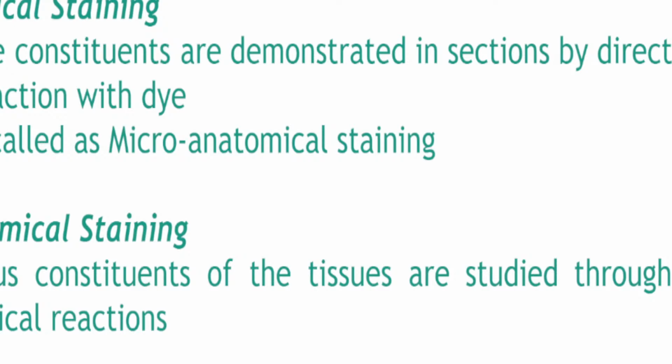Okay. All right. So staining is the first thing that comes to your mind when you talk about histology, right? Why? Because the first thing that you looked at in the microscope is a stained slide, 'di ba? Yun yung unang-una ninyo, magdo-drawing kami sa histology. Actually, yun din yung impression ko dati nung pumasok ako ng first histology class ko.